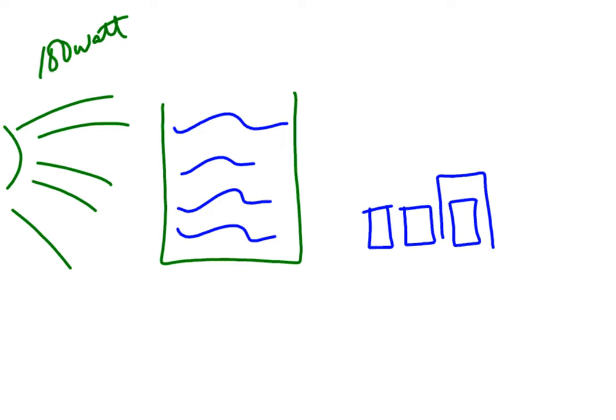Okay. Now you're going to be taking samples from this on a regular basis. You're going to be putting them in the colorimeter every 5 minutes for 15 minutes. So you're going to want to make sure you put it back in the same spot.